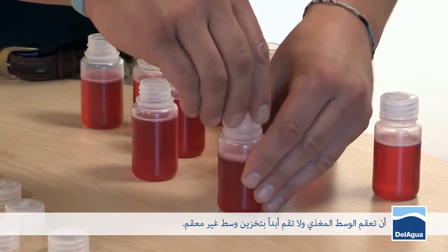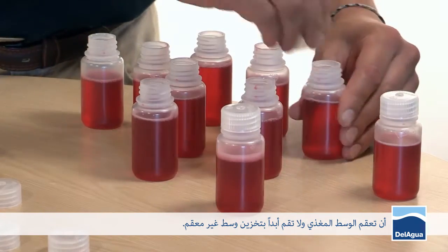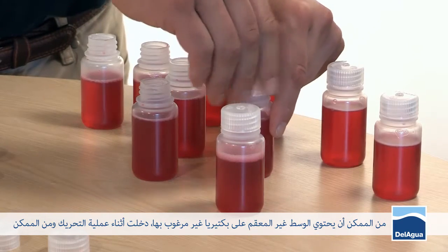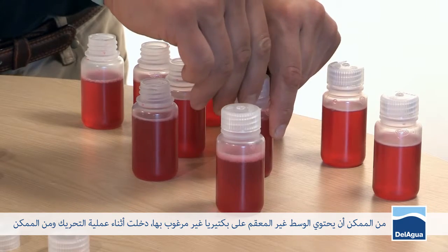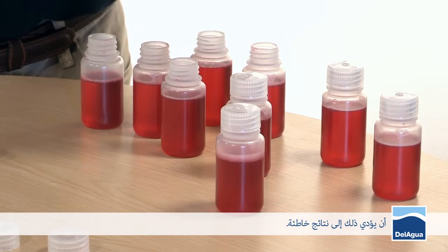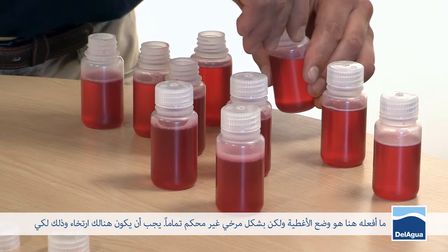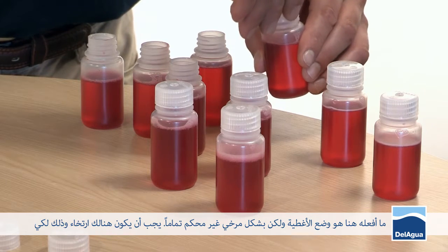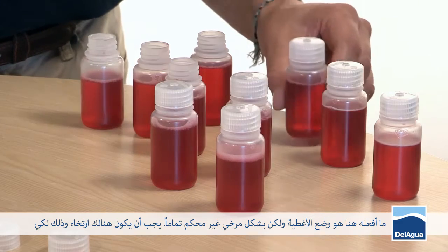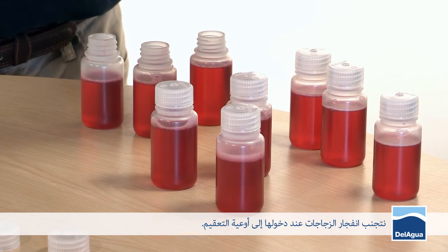It's very important that you do sterilize your media, and you should never store unsterilized media. Why is that? Unsterilized media could have unwanted bacteria in it from the mixing process, which would give you false results. What I'm doing here is loosely applying the lids so they are on but not securely fastened — there should be a good rattle in the top of the bottle. This will mean that when they go into the sterilizing vessels, they won't explode.